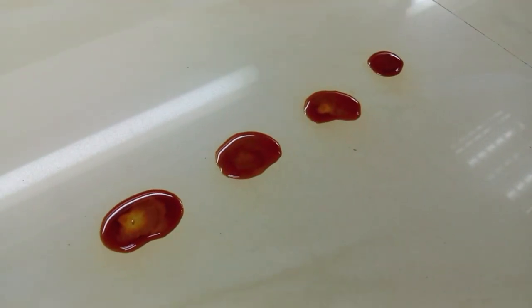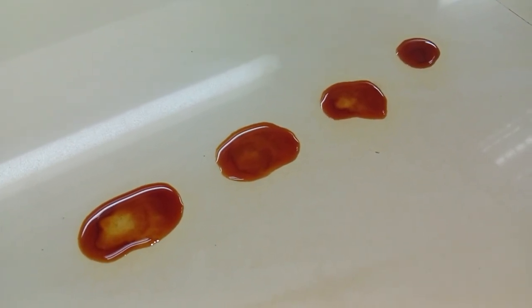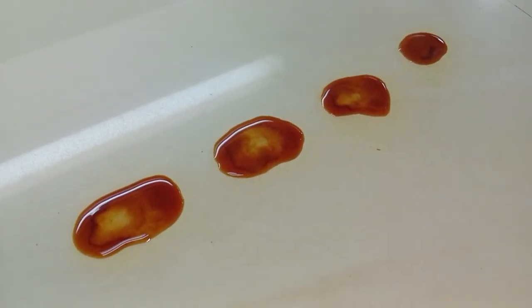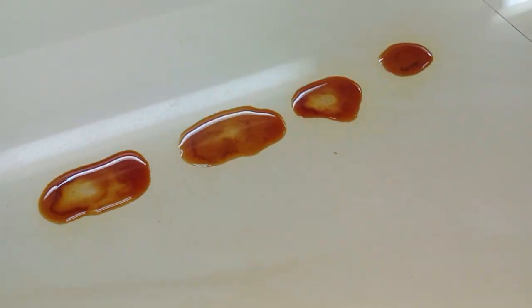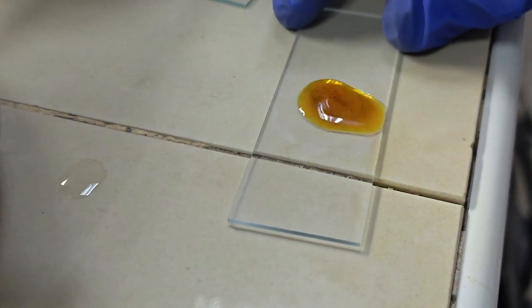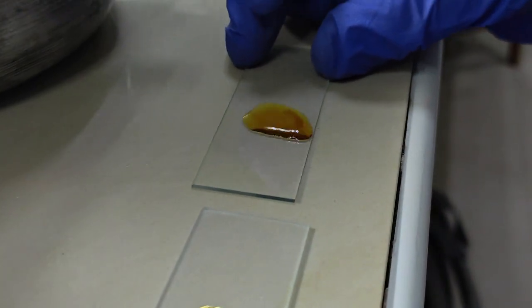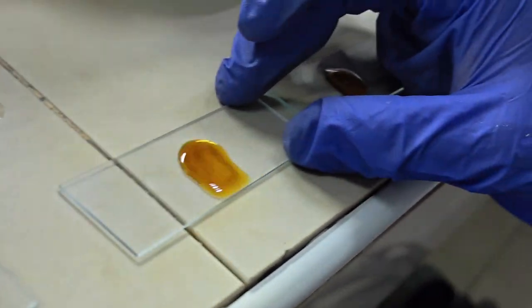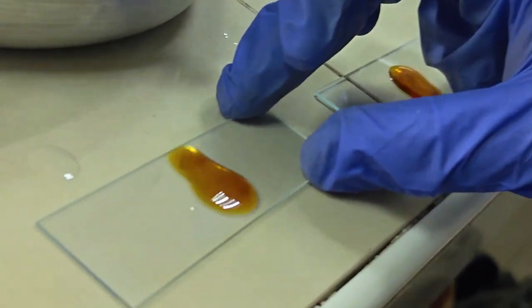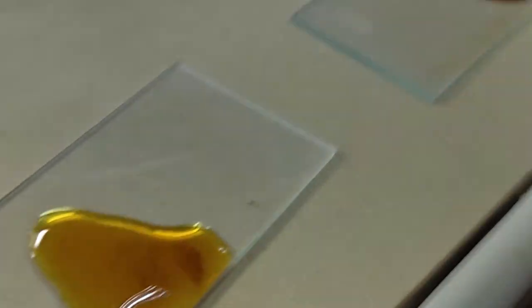Among all temperature conditions, the test tube at 37 degrees Celsius showed the fastest starch digestion, indicating the highest enzyme activity. At 5 degrees Celsius, digestion was much slower because low temperature reduces molecular movement and enzyme-substrate collisions. At 60 degrees Celsius, the enzyme activity decreased because the enzyme became denatured. Denaturation changes the shape of the enzyme's active site, preventing proper binding with starch. This result shows that salivary amylase works best near normal body temperature.